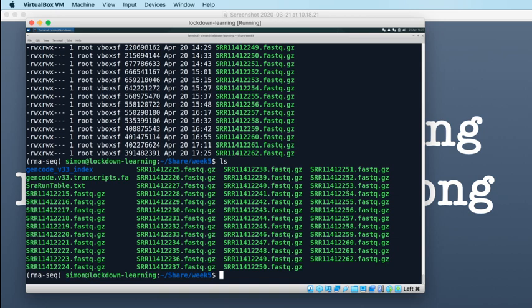So when we run salmon, we want to run salmon 12 times. We don't want to run it 48 times. So not once per FASTQ file, but once per sample. And that's quite an important distinction. It means that whenever we run salmon, we will be giving it 4 FASTQ files as input, the 4 files that correspond to the sample that we want to analyse.